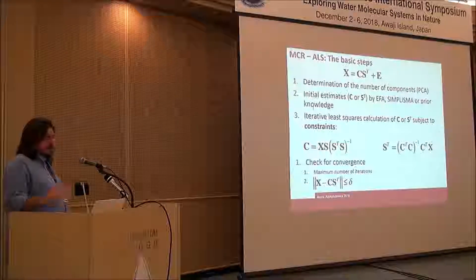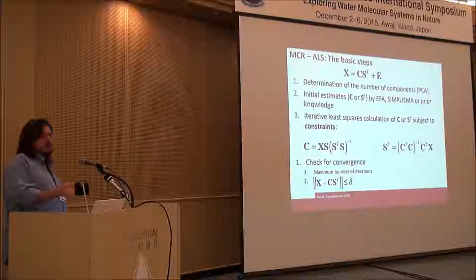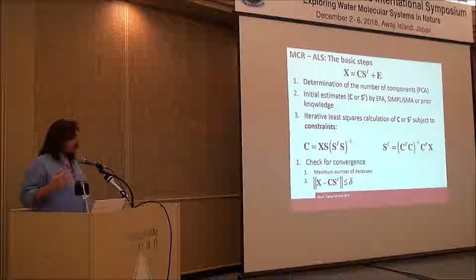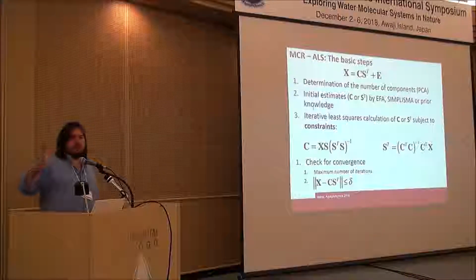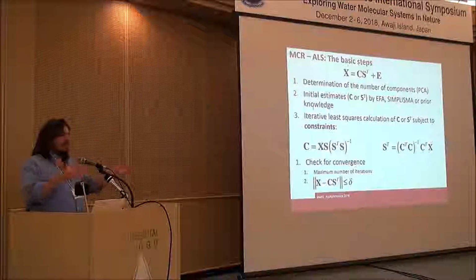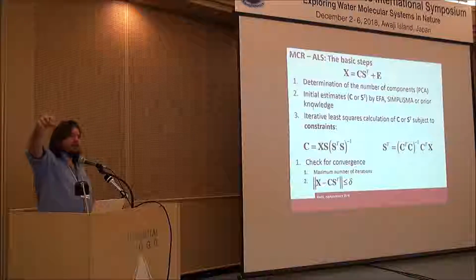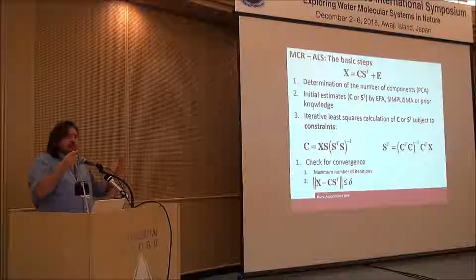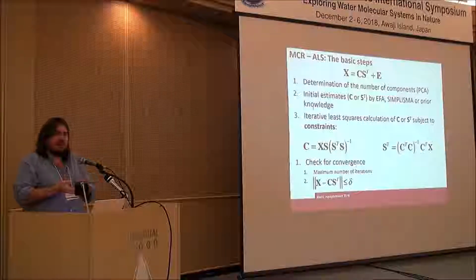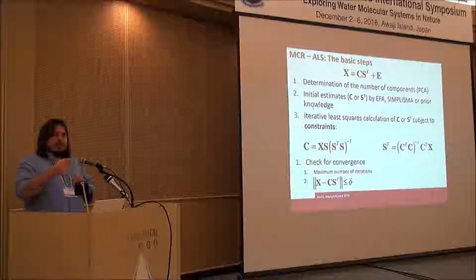And then of course the procedure is quite straightforward. In this case, we cannot rely on the same concept as in PCA, because we need to input constraints, and unless we do it with quadratic programming or some fancy stuff, the best thing to do is something that is called alternating least squares, just a ping pong. So we make an educated guess of one of the spectral profiles, and we fit the concentration, and then we check whether this concentration shape would meet the chemical constraint that we want, and in case we use this updated estimate to estimate the spectra back.